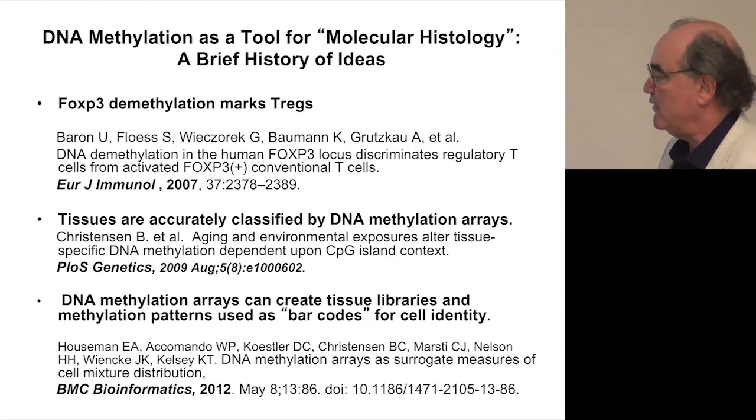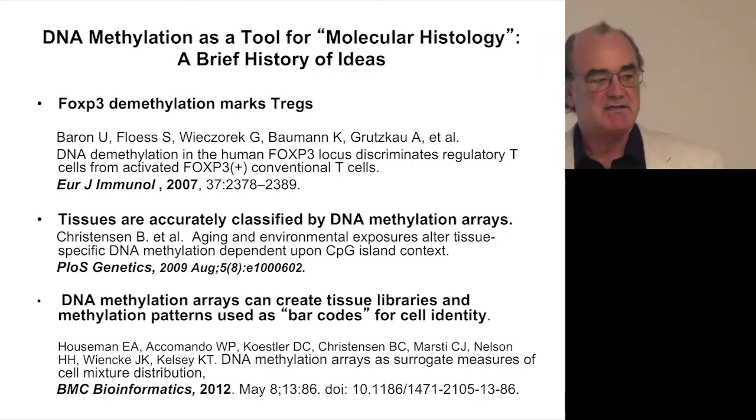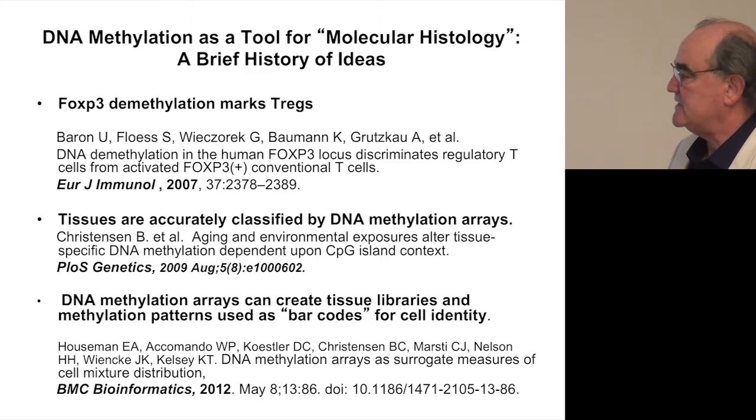And that's really what led us to digital PCR, although a lot of what I'm going to show you is array-based, and we've used the digital technology and qPCR in a confirmatory way for these arrays, much as what you've heard earlier in other talks. But they're also interesting standalones.